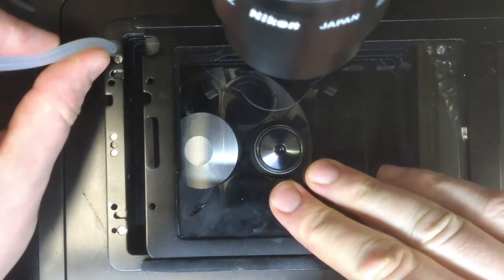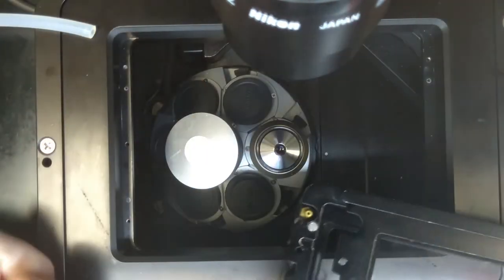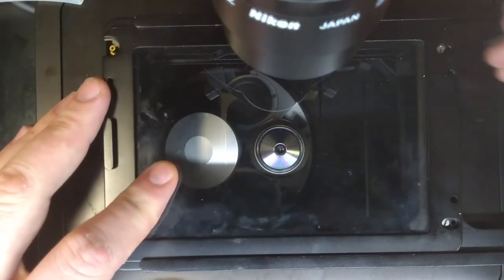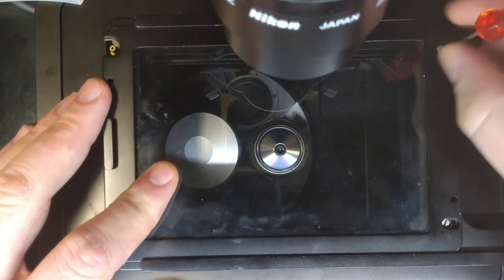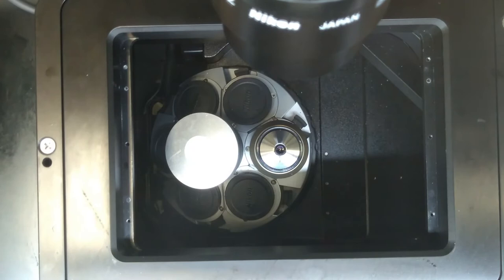And then detach the gas tube. The stage will now lift free. If you feel it wobble but it doesn't come free, loosen all of the appropriate screws again. This will now come away cleanly.